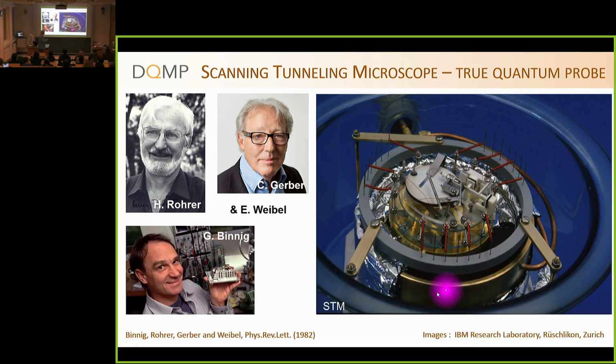What is interesting here is that because of these vibration issues, this system is mounted on superconducting magnetic levitation. So to decouple the instrument from the surroundings, they decided to put this on superconducting levitation. And that's how they decoupled the end part. Of course, there's much more isolation around, but the very final decoupling was done by this levitating system.